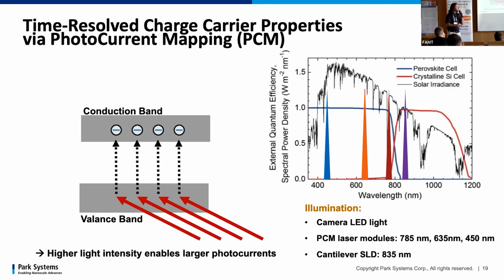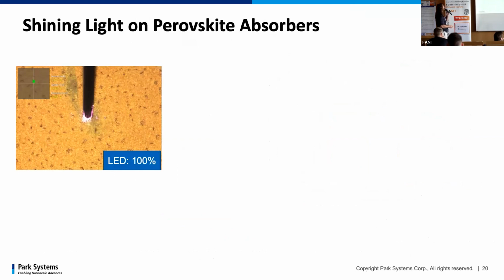For example, in a recent experiment, which unfortunately I can't show you today, I mapped basically a tandem solar cell made of silicon solar cell and perovskite solar cell, where I only illuminated the silicon part by using just the superluminescent diode, basically. So I could map the trap density within the perovskite film while not being illuminated. Quite interesting.